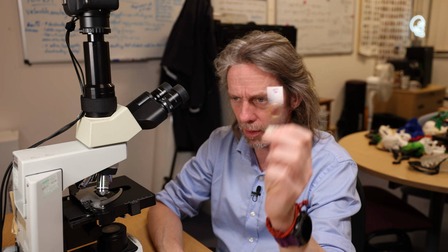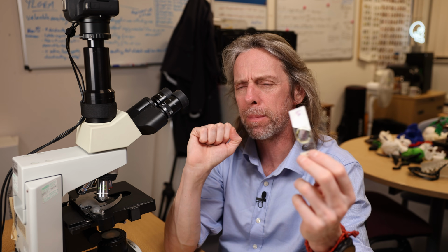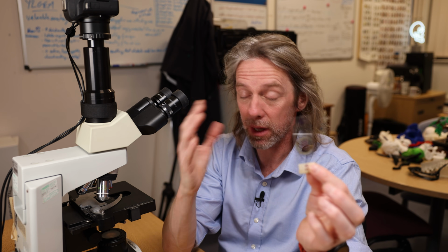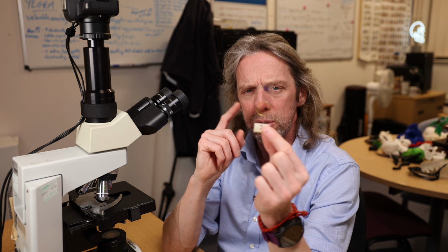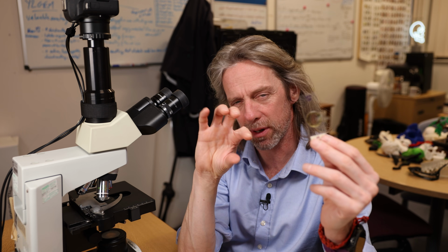But the ovary, okay, so the ovary is the organ, the gonadal organ, in which we find oocytes, egg cells, and one of those oocytes is going to be released each month in humans, ready for fertilization by spermatozoa to create a new individual. So we're going to have a look inside the ovary, and we're going to see lots of oocytes, and some of them are going to be kind of in a resting state, and we're going to see oocytes surrounded by supporting cells, follicular cells, which will become granulosa cells.